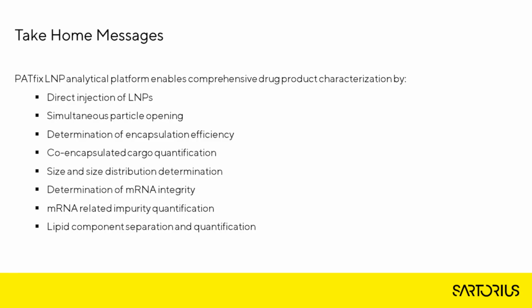Okay, and this brings me to the end of the webinar. Just a few take-home messages for the end. Using this LNP switcher, there is no need for any sample pretreatment. The LNPs can be directly injected on the system and then analyzed.